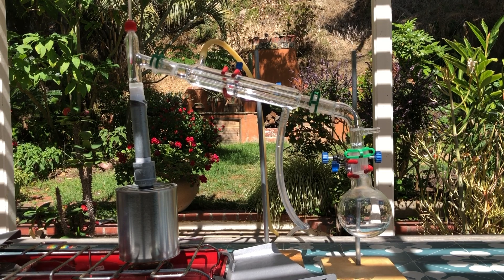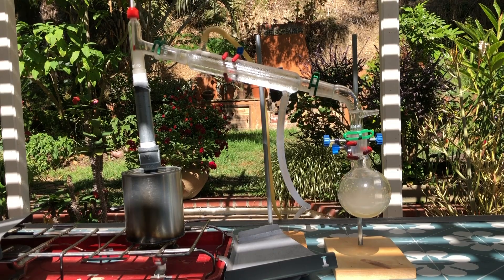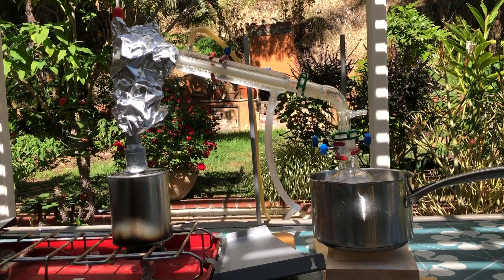Then I set up for distillation. After about a half an hour, white vapor made its way up the still head but was having trouble making it past the angle. Additionally, the heat from the propane was starting to warm up my condenser, so I insulated the apparatus with some aluminum foil.